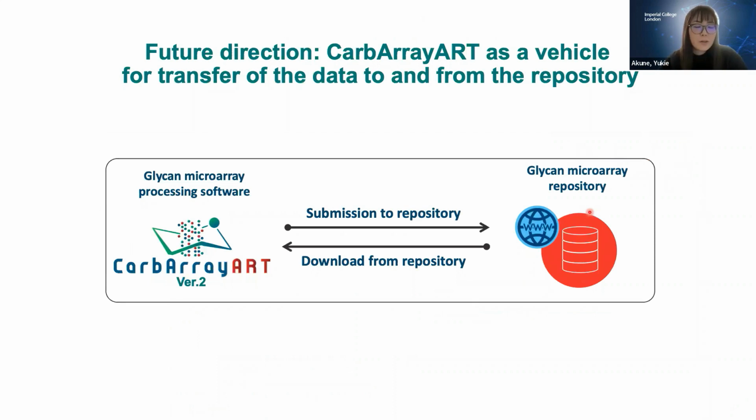Very briefly, the future directions. We are now working on CarbArrayART version 2 to be able to handle the transport of data to and from the glycan microarray repository, which will be introduced in Renee's talk next month, I think.